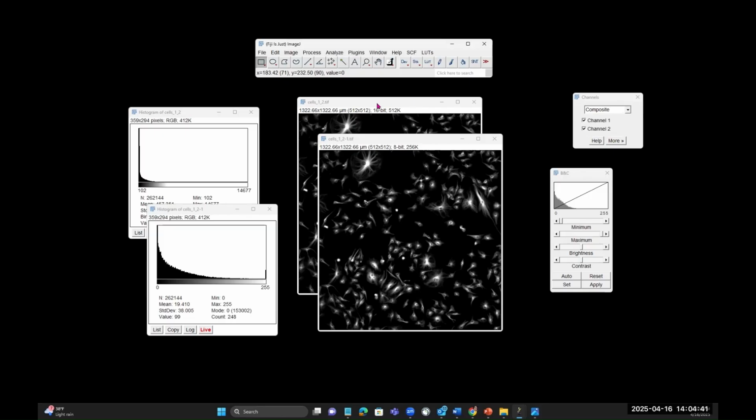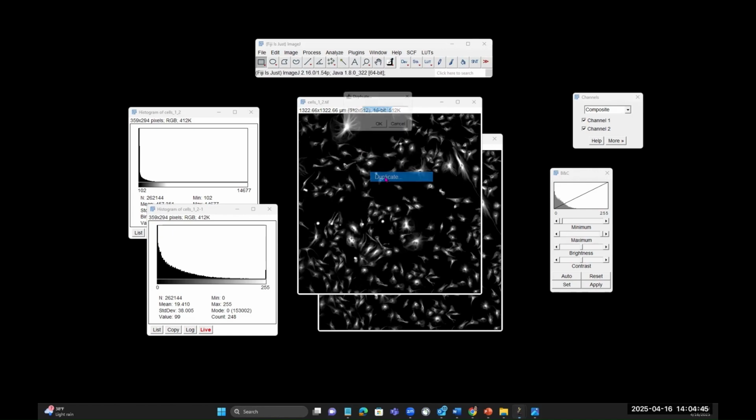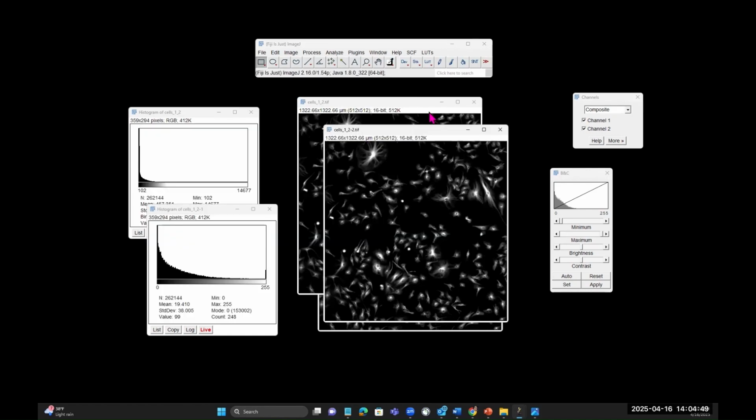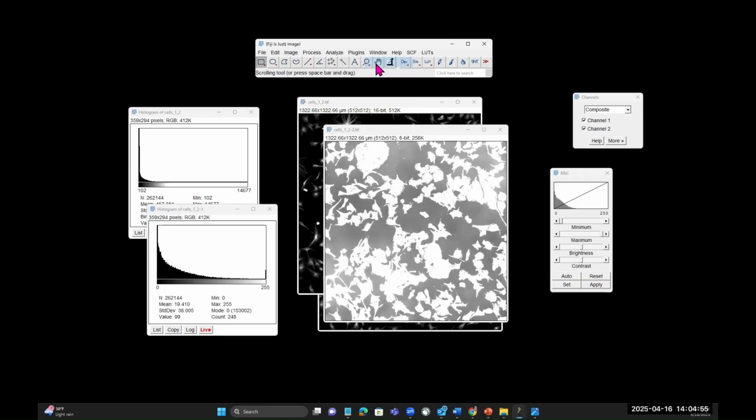Okay, so I'm going to go back to this image here and duplicate it. Then I'm going to change this now to an 8-bit image. Okay, so this is what you're going to see.